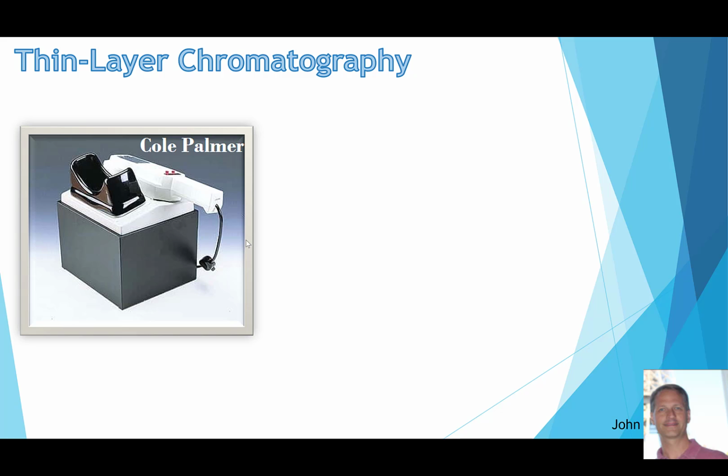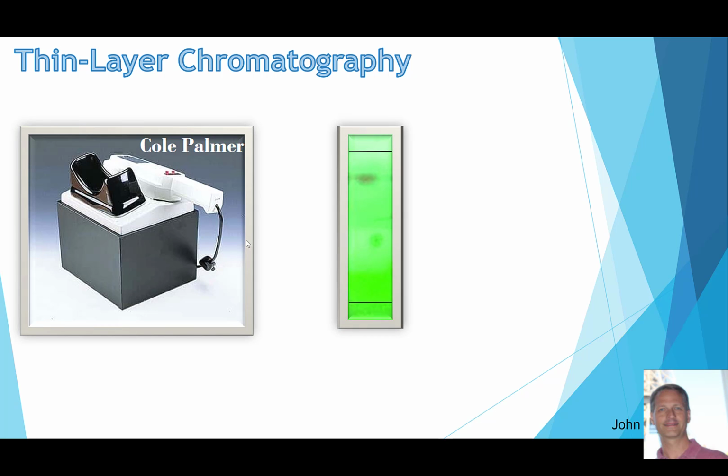And what we use is a type of TLC plate that has a natural fluorescence. So it's coated with a fluorescence indicator, and that indicator glows under UV light. So you put your eyes on this end right here, and you turn the lamp on. There's a little hole on the other end where you can put your sample in. You take a look, and the whole plate looks like this. And the dark spots are simply where the compound is masking the natural fluorescence of the TLC plate's background. So that's a type of plate that we use when we do this experiment.